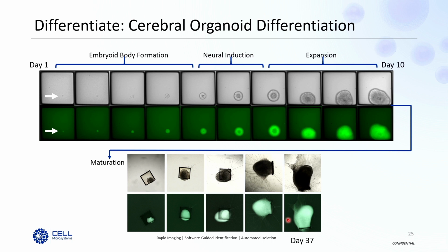Thanks. So you mentioned with the organoids, the raft can kind of stick around or go somewhere else in the well. If you're doing suspension cells and growing them to confluence and then passaging later, how do you make sure that you don't keep carrying the raft forward? And then also curious if you have any quantification of ghost wells with using this for cell line development for suspension cells. So about the raft, it's a very small piece of polystyrene.